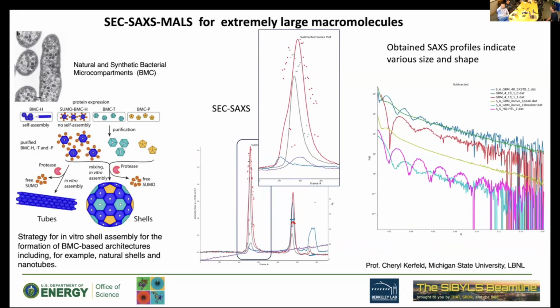Okay. Is there any way you would have to correct each slice, right? Yes. If you wanted to have a nice constant Rg across the peak as you have in the second peak, I would recommend merging a few points only and looking at the curve and calculating the Guinier for each section manually. And this is also what we potentially will do in tutorials 3 to 5, if you have that question: how do you define how many points is the minimum for your linear region?